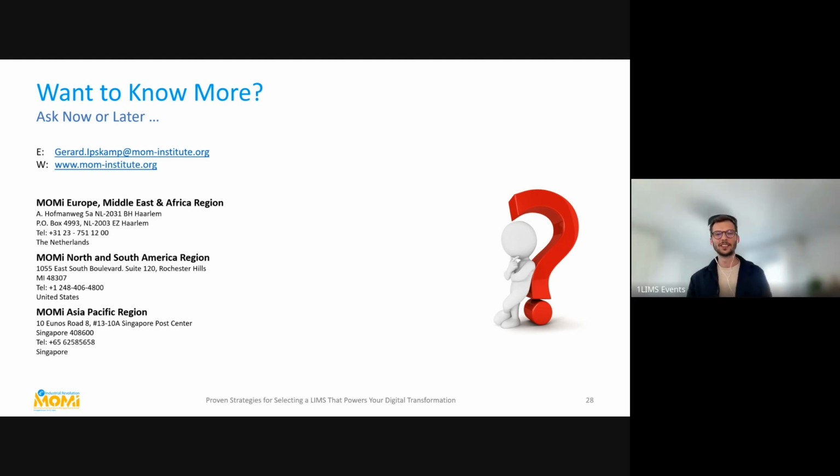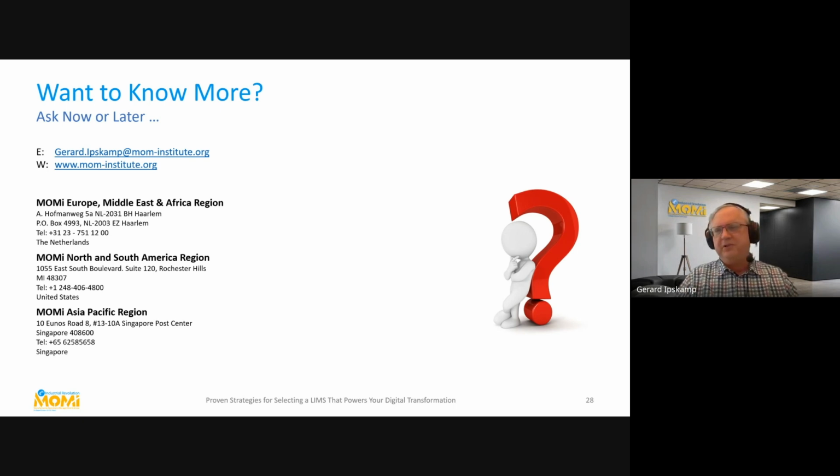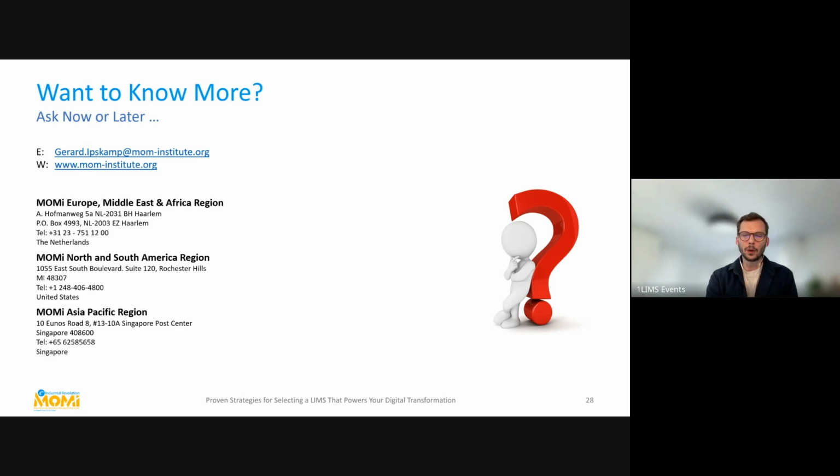Yeah, true. It's just to review the current state. Yeah, the new current state after 6 months of being live, then look at the new current state and see if you missed something. And most of the time they miss something somewhere. An equipment that was promised, or an interface that was promised and not implemented, or something like that. So yeah, I recommend it. Good. Yeah, we also do this at every LIMS implementation project.